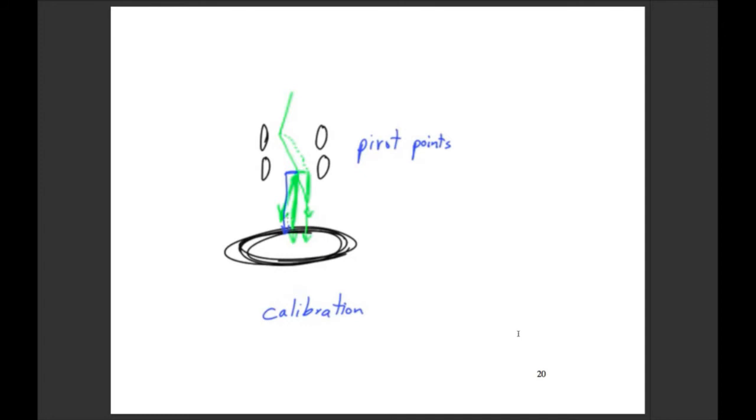This is all a lot more helpful if you're on a microscope too. Right, but is it more that the processing is supposed to? It's not a processing thing. Yeah, this is at the hardware level. We're talking about the beam at the microscope level. So I don't think this is something you would be able to see in your images. I don't think you'd be able to identify in a bad image that it was a pivot point issue, because there are so many other things that can go wrong that make the image look bad. Only a few things where everything can go right and the image looks really good.